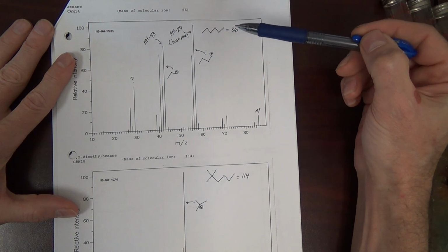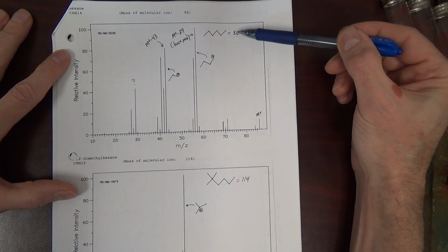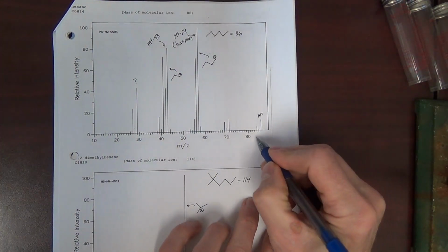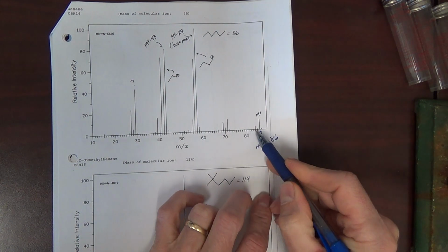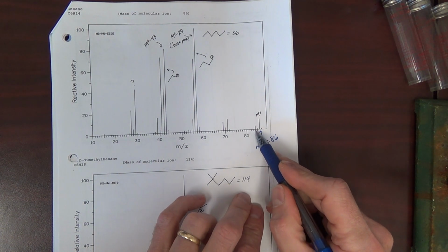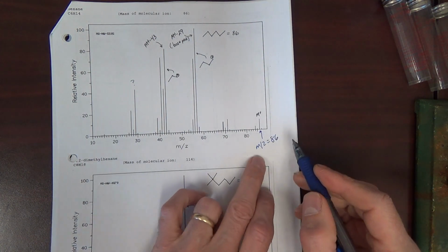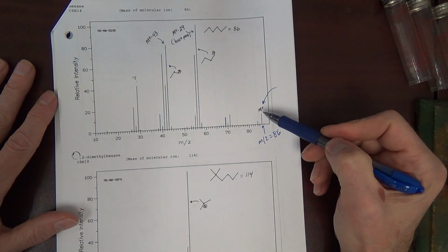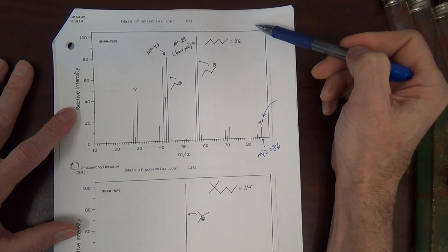This is hexane, C6H14, a nominal mass of 86. This is the mass spec of hexane. Here at 86, we have m/z equals 86, because that's 85, 1, 2, 3, 4, 5, 85, and then that's 86, where this peak is. And so this is our molecular ion. Again, this is where this molecule underwent ionization to form the molecular ion.